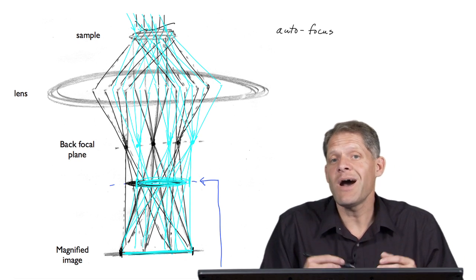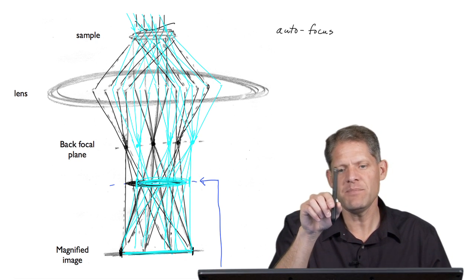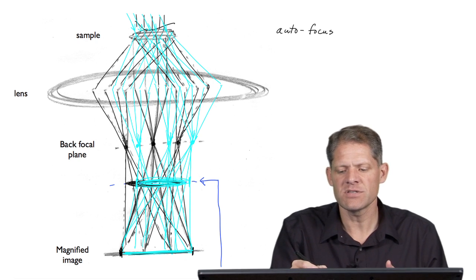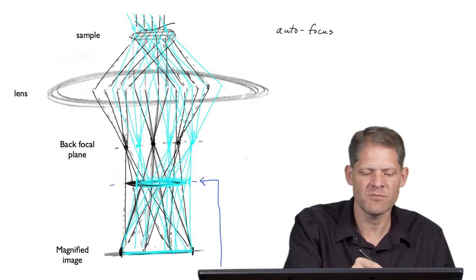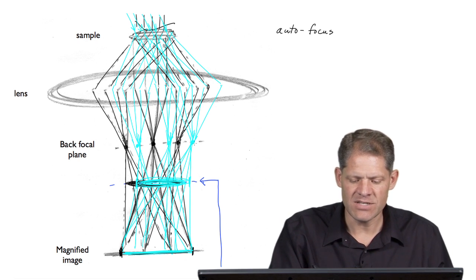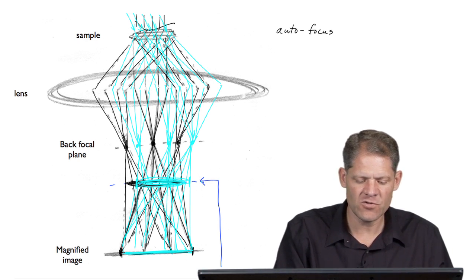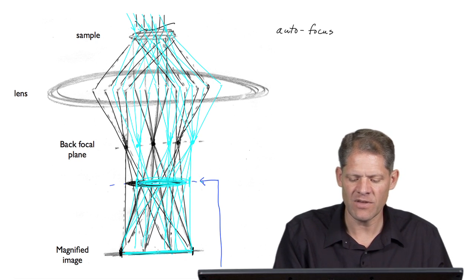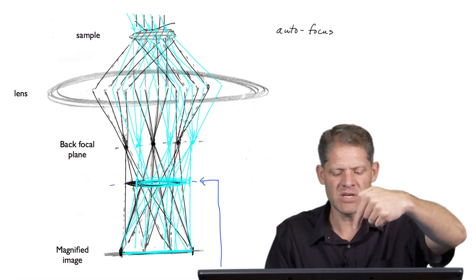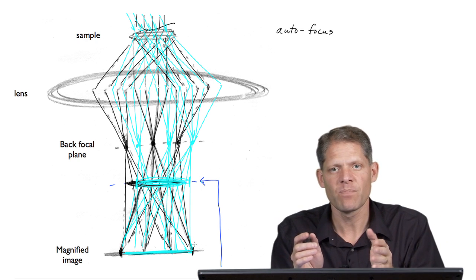Because of this, we can automatically find focus by wobbling the beam tilt and then adjusting focus, in other words, adjusting the strength of this objective lens more or less until our detector becomes conjugate with this true image plane, this ideal image plane, where even though you're wobbling the beam tilt, the image itself doesn't shift either to the left or to the right.